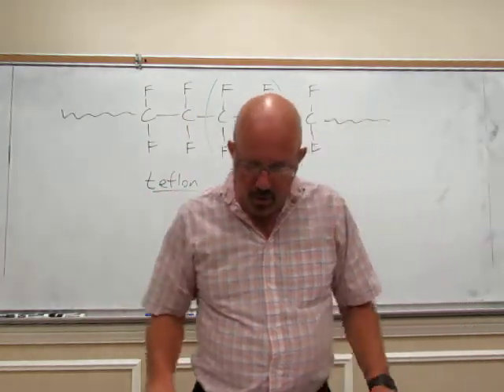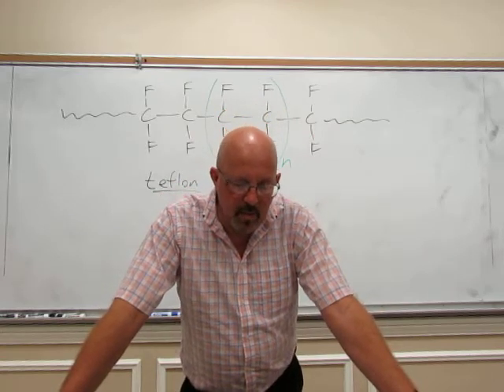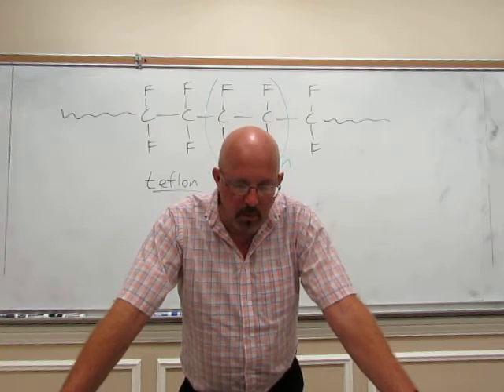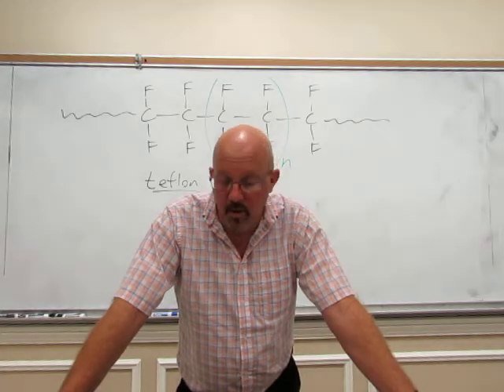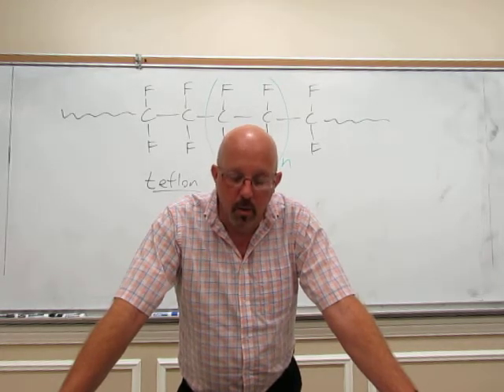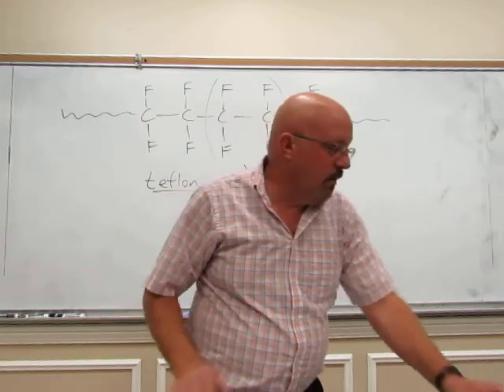Okay, this is a very short lab this week. So as I mentioned at the beginning, we'll have to remove the radical inhibitor. We're doing that using alumina. And we're going to use a disposable column this week, so not the column that's in your kit. We're going to use a Pasteur pipette this week.